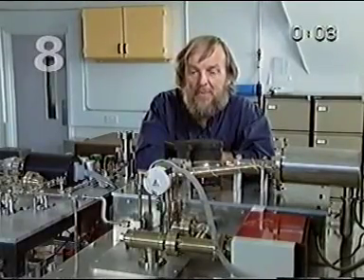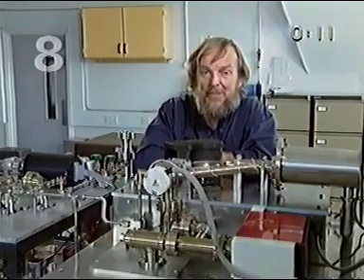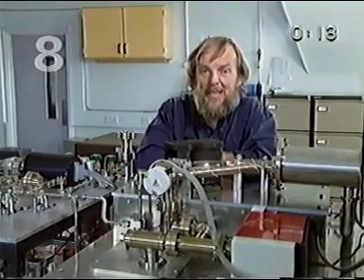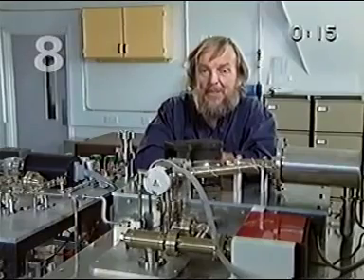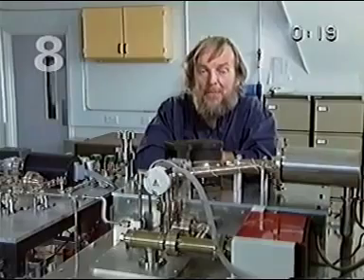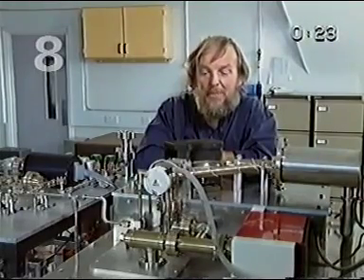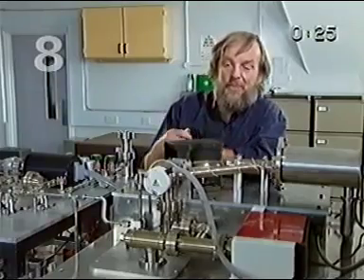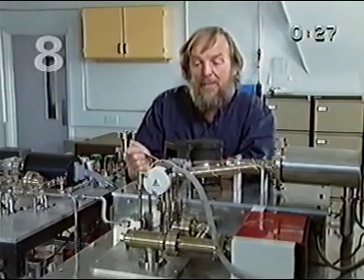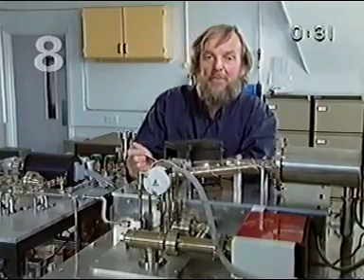In Chapter 8 of Block 2, you will have encountered mass spectrometry. All astronomers are aware of the electromagnetic spectrum, but in planetary sciences, the mass spectrum of the elements is something which provides important information about solid materials. Mass spectrometers can be enormous, occupying a whole room, or they can be small, like this gas source machine. The feature they all have in common is the ability to separate mass by passage through a magnetic field.